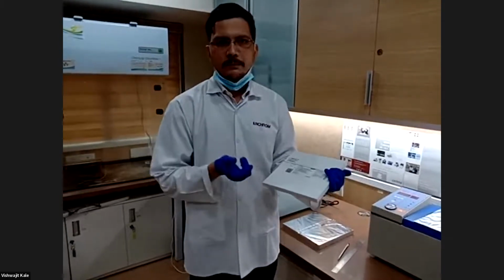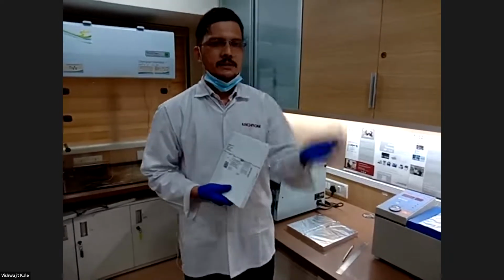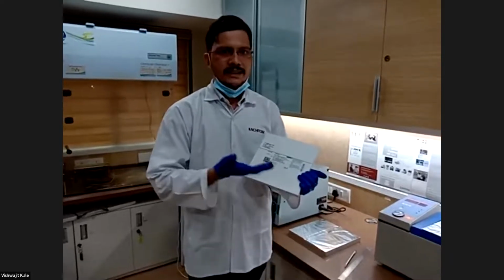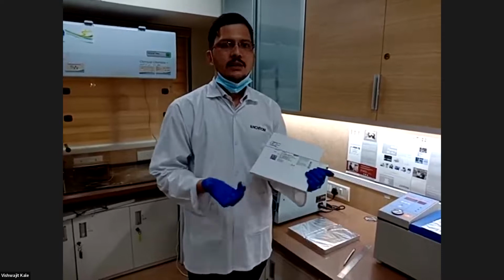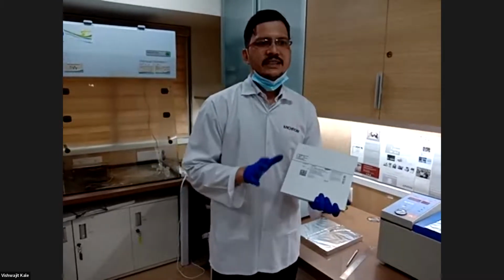Normal phase chromatography, reverse phase HPTLC also you can perform. Reverse phase plates are also available. Cyano-modified, amino-modified plates are available. Most water-resistant plates are also available in the market. So more than 50 different types of stationary phases are available.